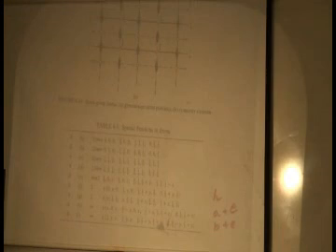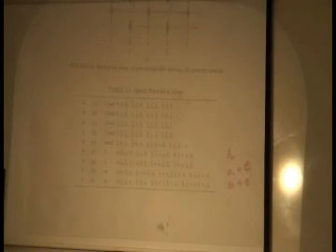So, it's obviously not A and E, okay? And you will find something very similar if you try to do B and E. Okay, because B gives you the same thing. You should have a peak there at 1/2, 0, 0. There is no peak there. That really doesn't leave us many options, does it? That means our atom is in H. Okay? Position H.